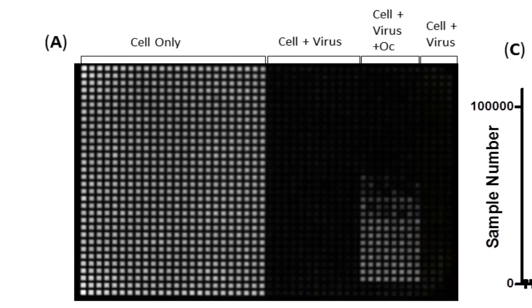So the point is that we want uniform cell growth, uniform virus killing, and a contrast between the virus-killed culture and the intact cells, with big gaps. So the signals are very different. Signal to noise, a clear separation between the live cells and the killed cells.